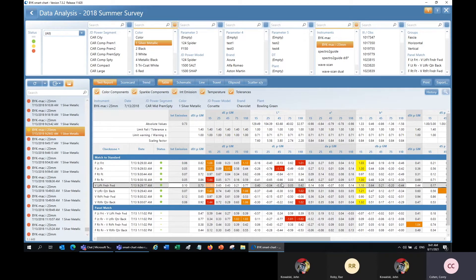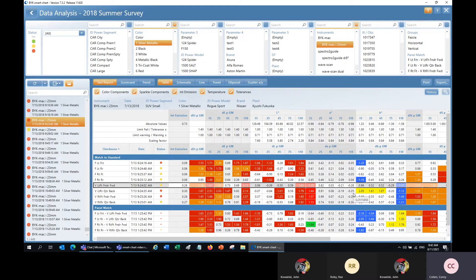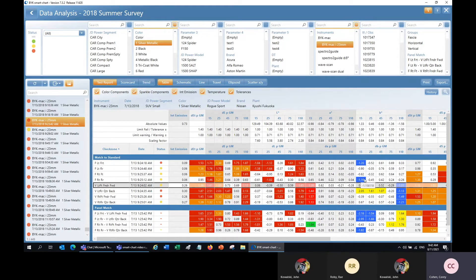That is true for the L value as well. When we get to the A and B values, those are actually highlighted in the direction in color space that they're off. These A values highlighted in red are actually too red — out of tolerance in the red direction. This value here is out of tolerance in the green direction for this panel match. For the B value, it will highlight in yellow or blue depending on the direction it's off — cells highlighted in blue are out of tolerance in the blue direction, and yellow highlighted values are out of tolerance in the yellow direction.